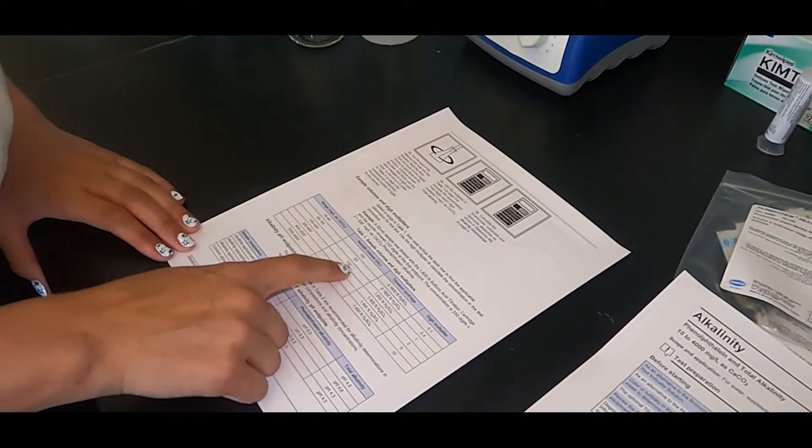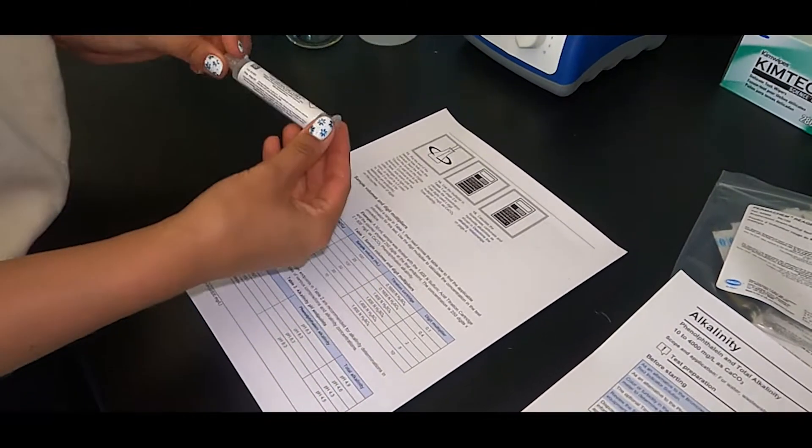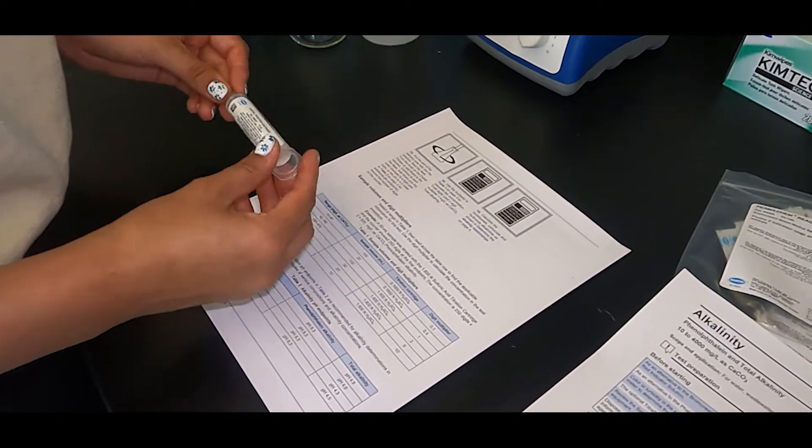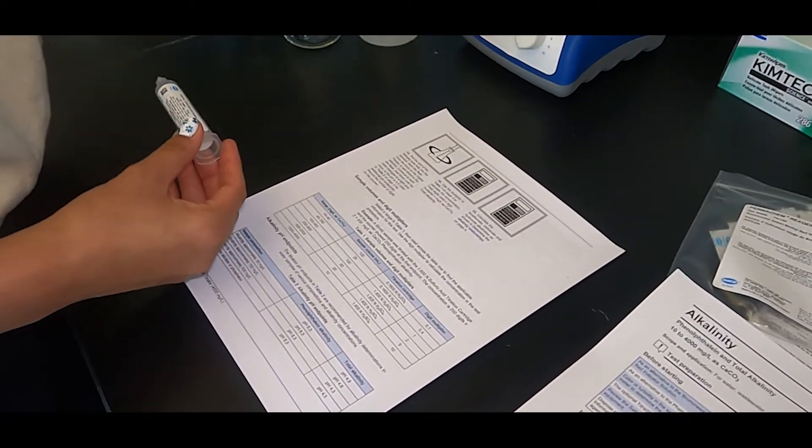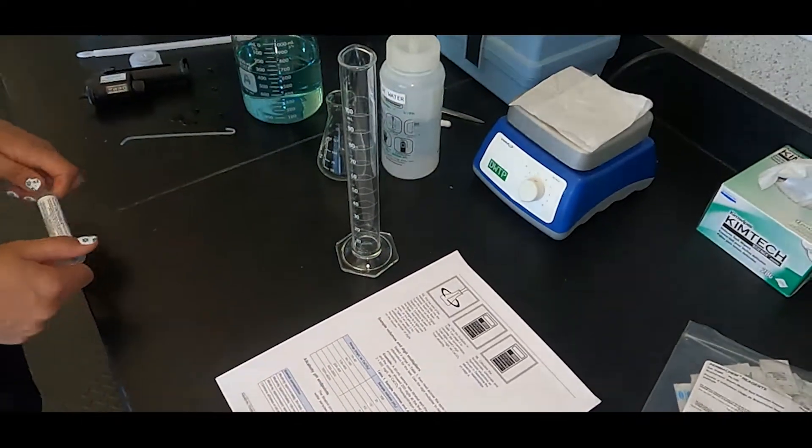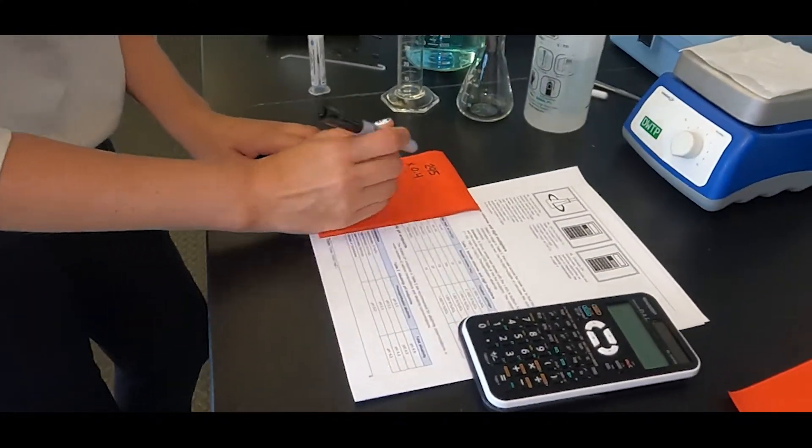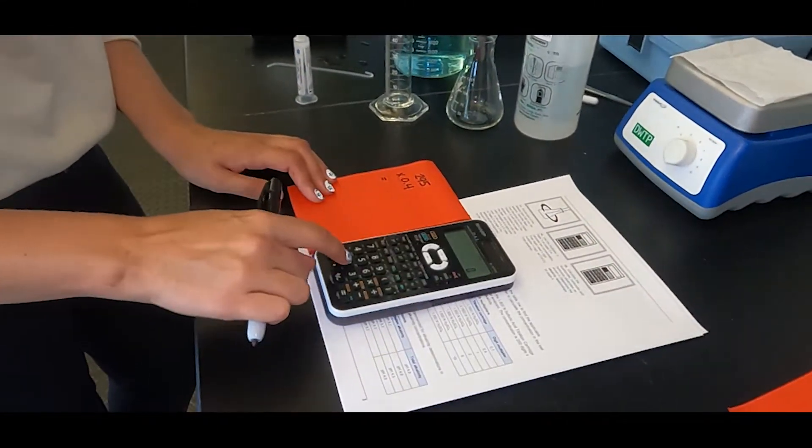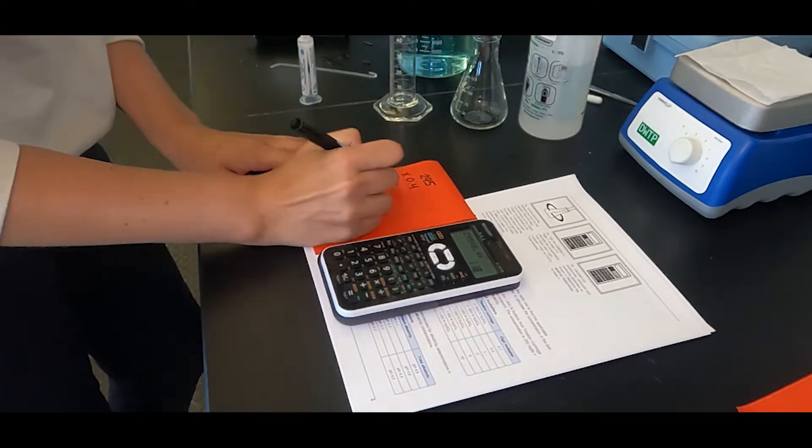Select a sample volume and titration cartridge from the table provided in the method. You may need to adjust and repeat the test as necessary. The digit multiplier will be what you multiply your titrator result by to obtain the true concentration.